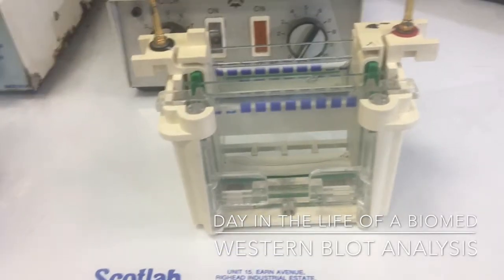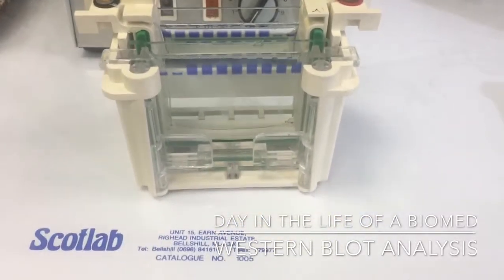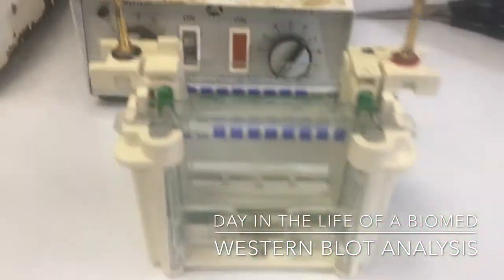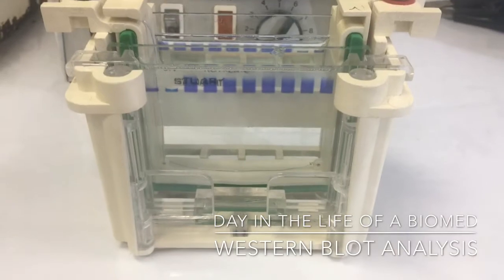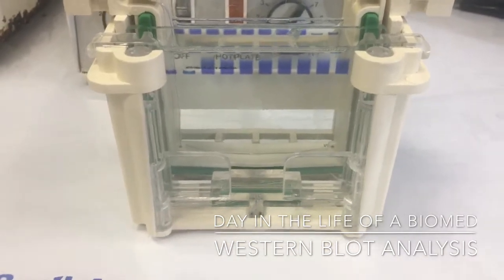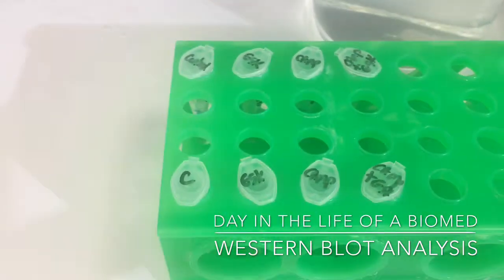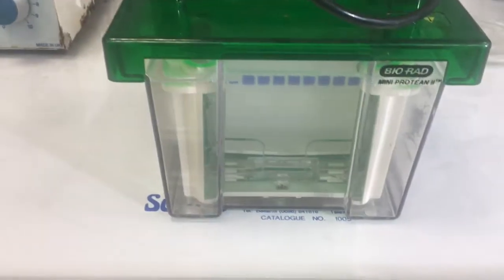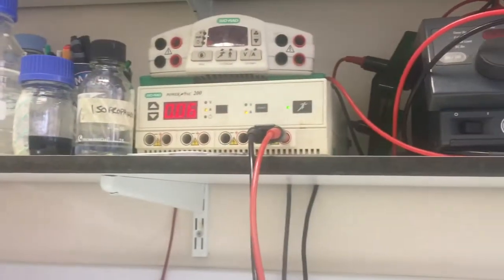Today I'm going to be doing a Western blot. The first step is the gel electrophoresis. These are my samples right here — I've just loaded them onto the gel and I'm going to run it in a minute. It's all set up and connected now.